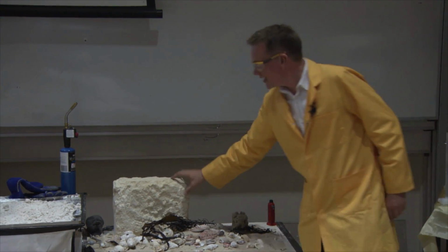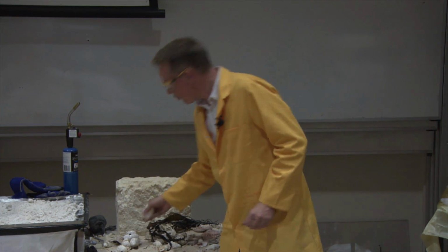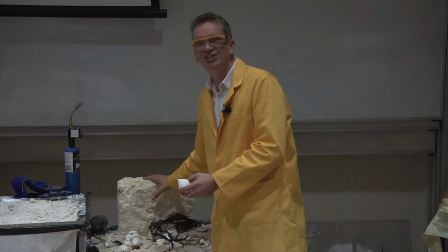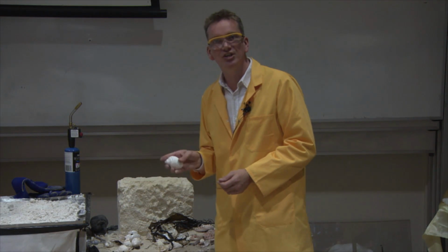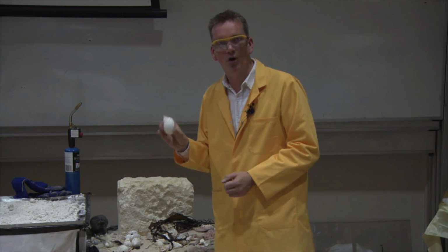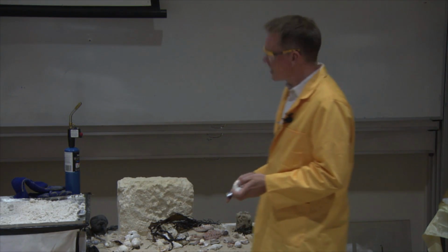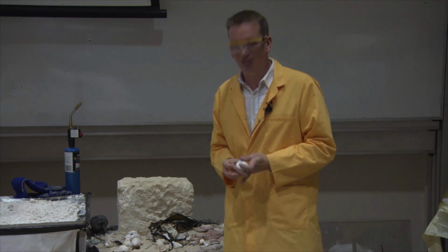But we can find this when sea creatures have fallen to the bottom of the sea over millions of years and become compacted. Well, this is essentially what this is made from. It's made from shells and skeletons of sea creatures. This is made from calcium carbonate. And I can show that because we've seen that carbonates react with acids, and we get bubbles of carbon dioxide given off.